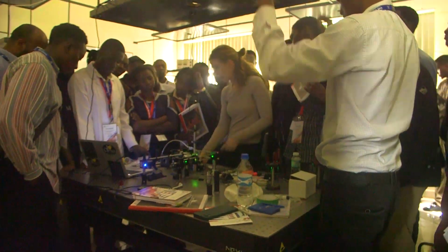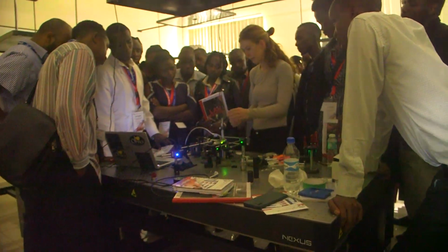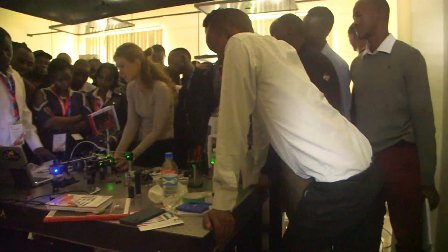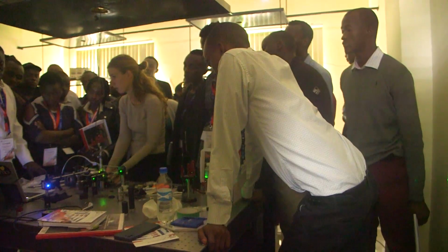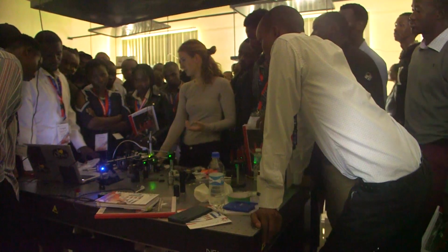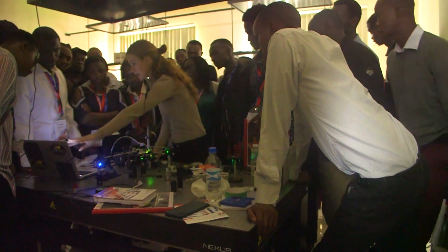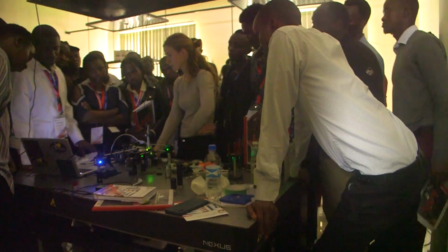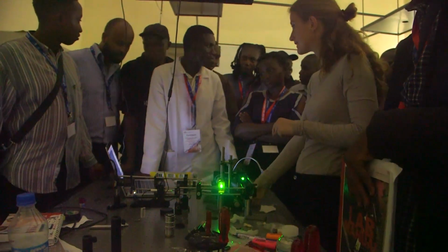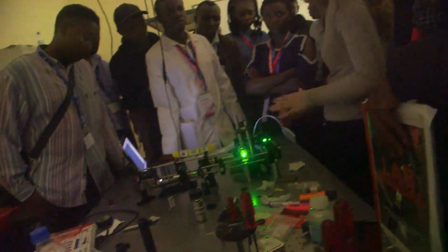Okay? So now I'm going to move through the sample. Look, what I'm doing is moving the sample in this direction. That's the surface, that's the start of the gel. And then I can go inside, plane by plane. These are planes of fluorescence, as you can see. All these stripes are just due to centers of absorption that are casting shadows behind. It's like 3D scanning, right? Exactly, it's as if I was doing a 3D scan. So this is more or less the idea.